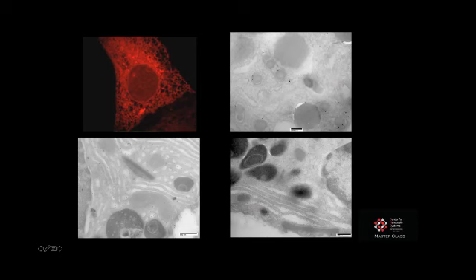You can see we can get 3 different sorts of label, or examples of what could be labeled in this image. In this picture here, we see the ER nicely, but it's just the cargo within the ER that is actually labeled. That may look exactly like this picture. In this picture here, we see that the large lumen of the lamellar ER is not labeled as much as these circular budding portions of the ER are labeled. And that might look exactly like this as well.